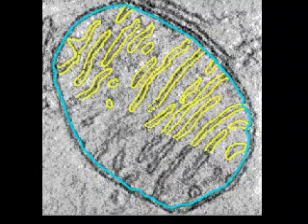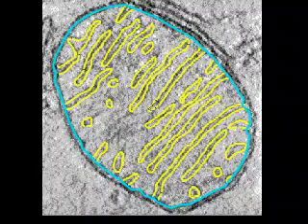This allows us to trace individual membranes in three dimensions. To create a three-dimensional model, membranes in an individual slice of the tomogram are traced. In this case, the inner membrane is traced in light blue where it parallels the outer membrane, and traced in yellow where it folds into the christi that protrude into the mitochondrial interior.